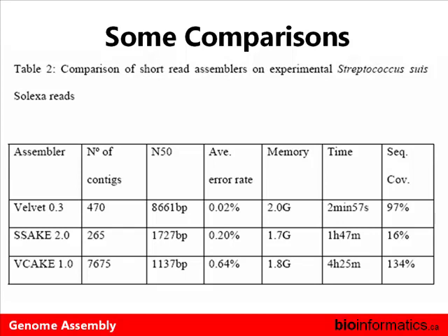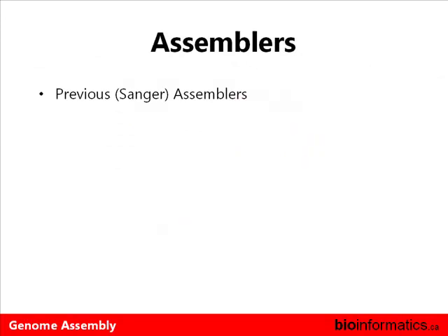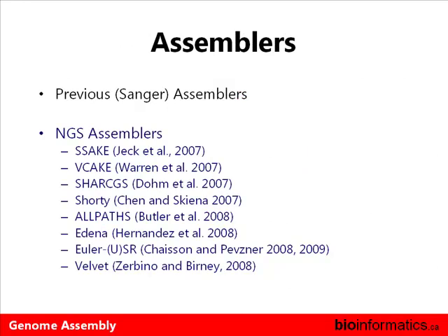The previous assemblers before Velvet were really a lot worse. By now there is a huge set of assemblers available for next generation sequencing. Velvet was the first one which had really spectacular results for short read assembly. ALLPATHS has also shown very good results. On the other hand, I've never run ALLPATHS, and I've never seen anybody outside of Whitehead who has run it. The results reported in the paper are absolutely spectacular, but I haven't actually seen it.